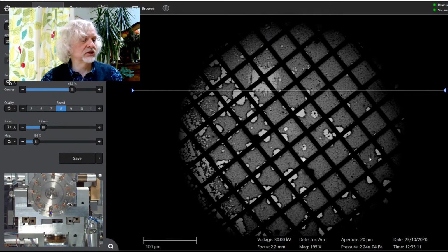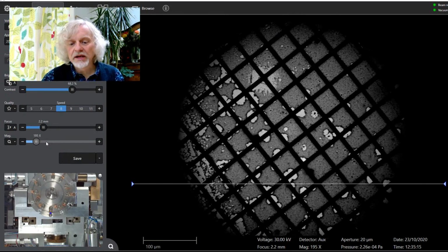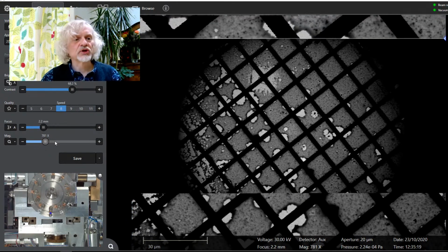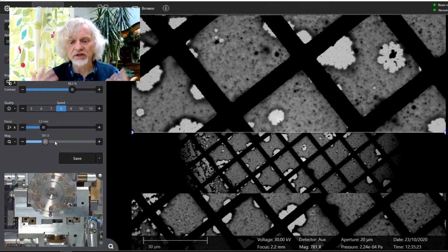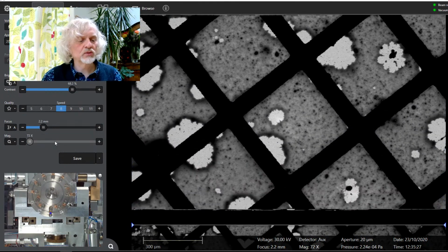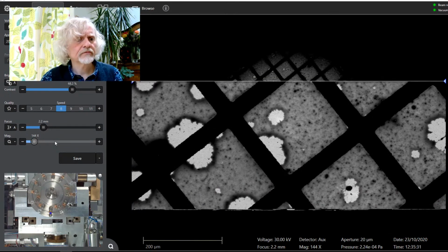Let's get on with it. Let's zoom in. Enough talk, more microscopy. Here we go. So I'm going to zoom in a little bit. We'll go in, and as you can see, it starts to sort of zoom in. And the reason why it's scanning down like that is because it's a scanning electron microscope. It's in the name. Nothing to be seen as yet because we're not nearly close enough. I'll keep going. Let's have a look.